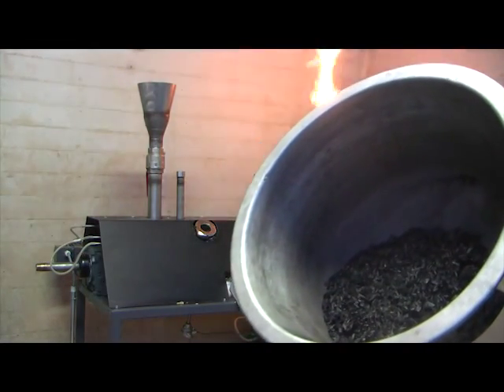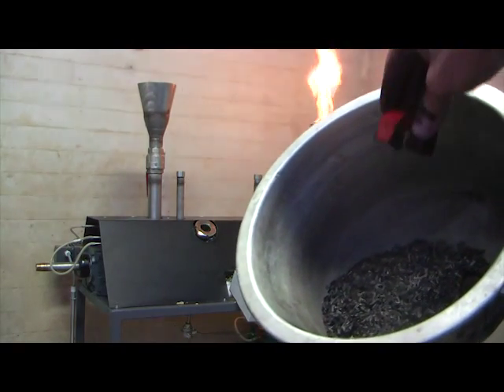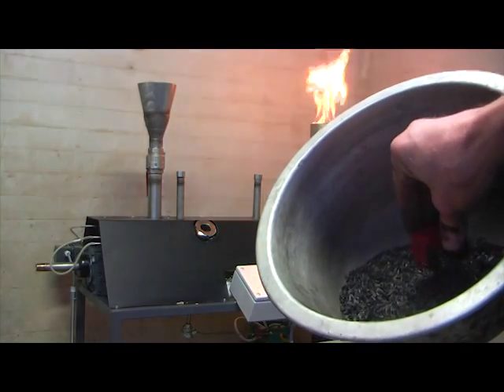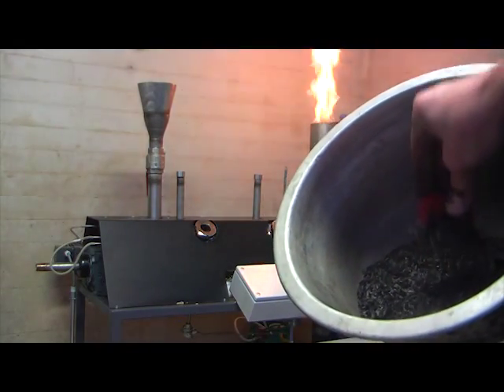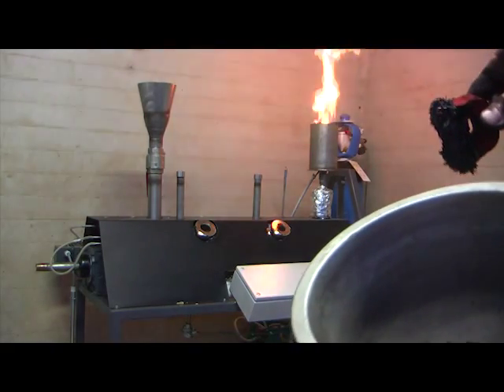We just produced some magnetic biochar that you can see here with the magnet. And here we have the biochar fixed at the magnet.